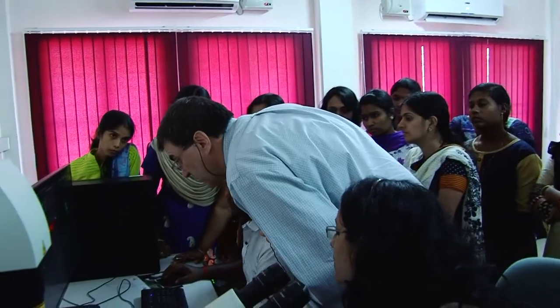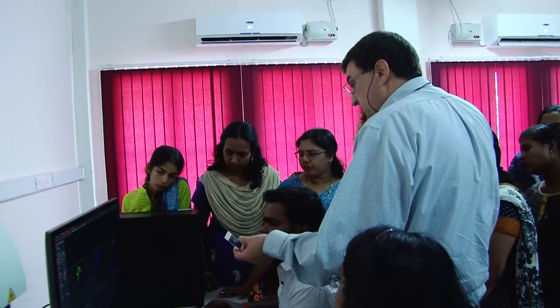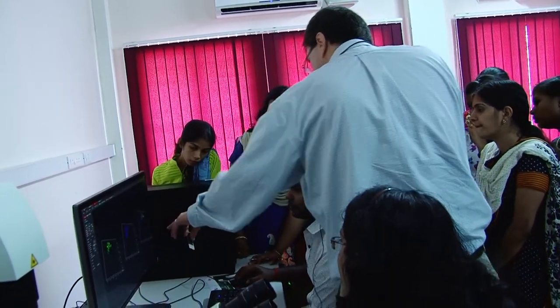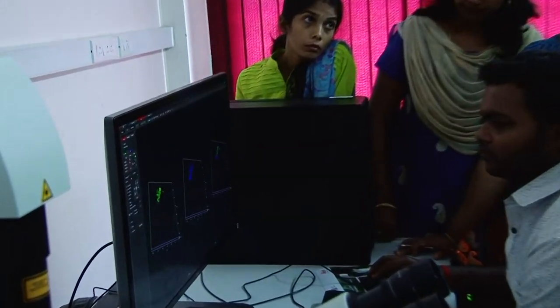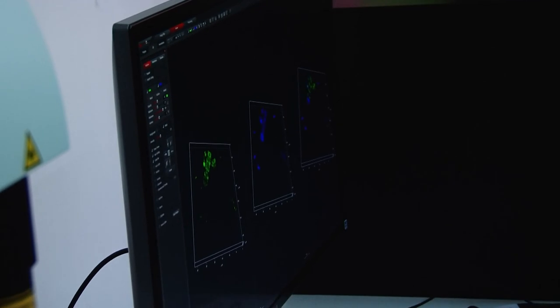It's gonna take like 3-4 minutes. Oh, it's done. Okay. So again, he has the ability to measure. He has the ability to look at his one channel, second channel, third channel. And remember, this is red, but we made it blue. Yeah, pseudo color, it's all fake. We can make the green blue. We can make, you know, whatever looks good.